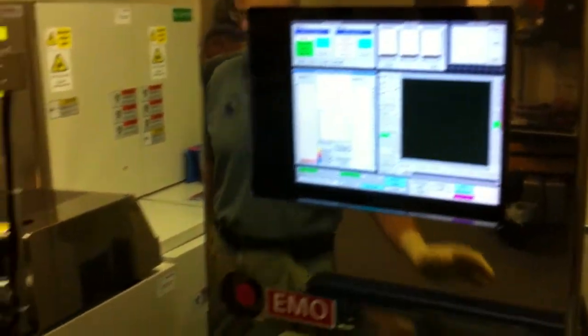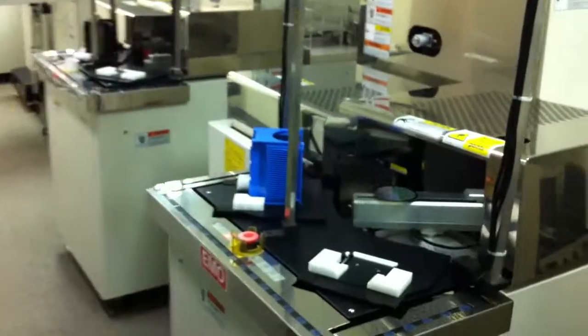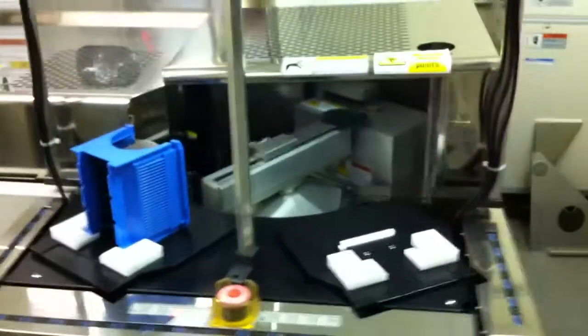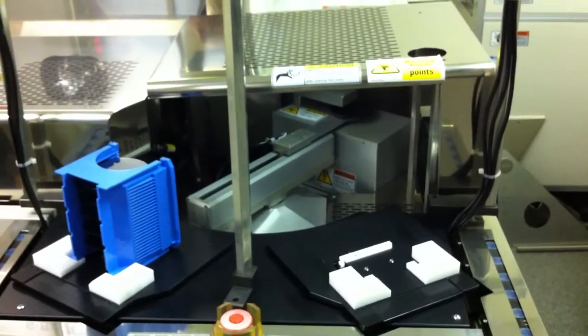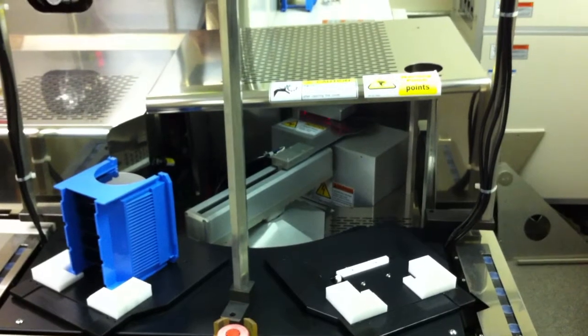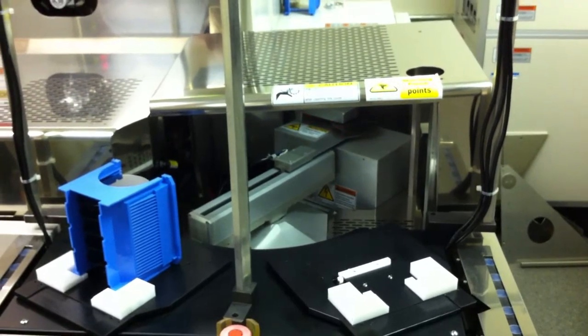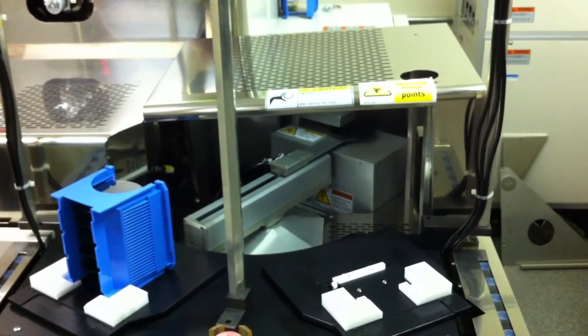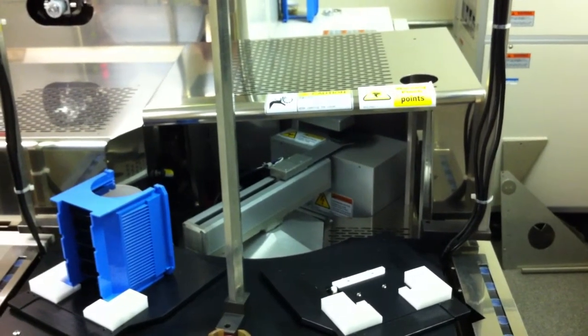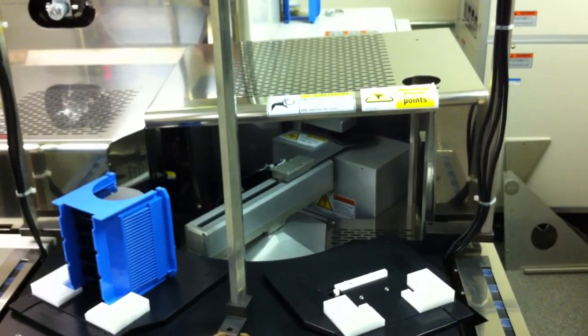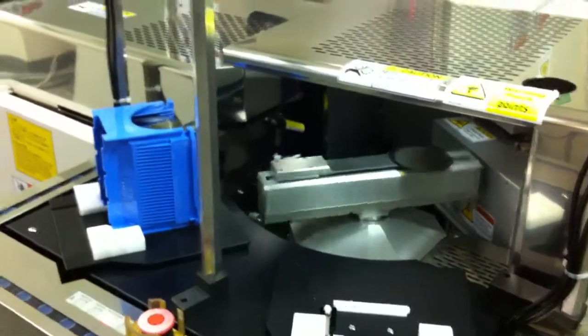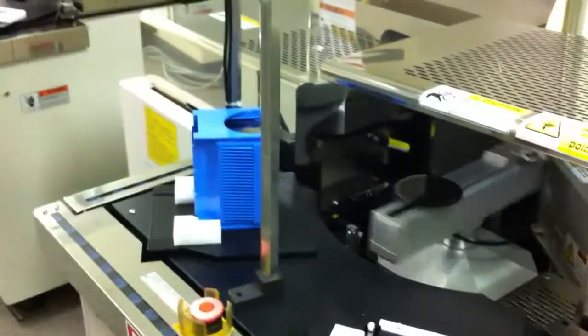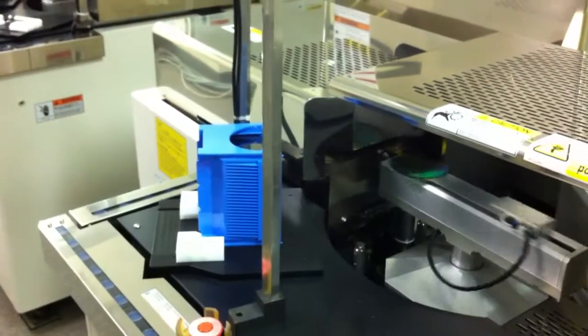First thing you'll notice is the wafer being pulled out right here into the flat finder. It's been modified for the wafer size. It does the flat finder, and then it's loaded into the exchange chamber.